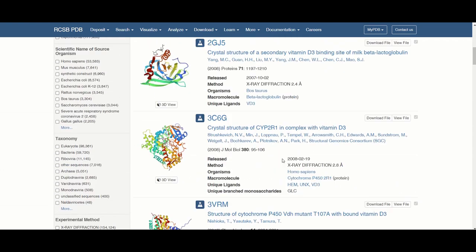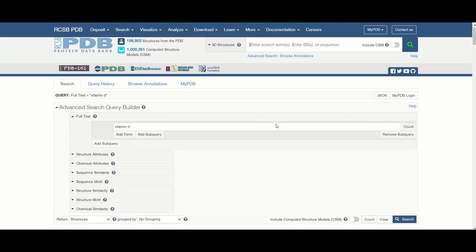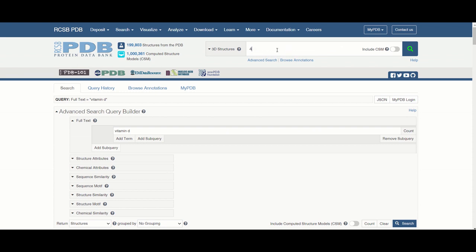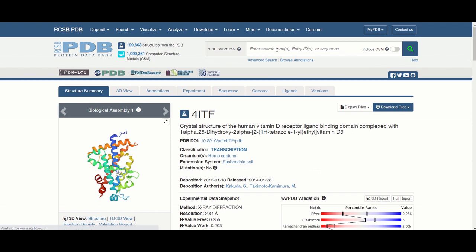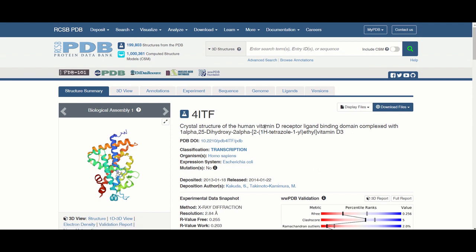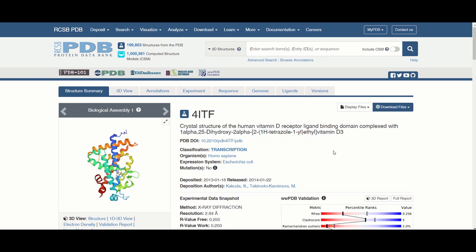And so in my case I'm going to look up a specific code for a vitamin D receptor which is 4ITF. And here's the crystal structure of the vitamin D receptor that is in complex with this particular molecule that I'm going to download.